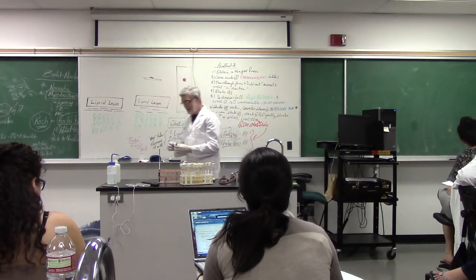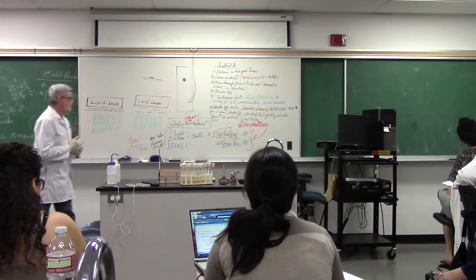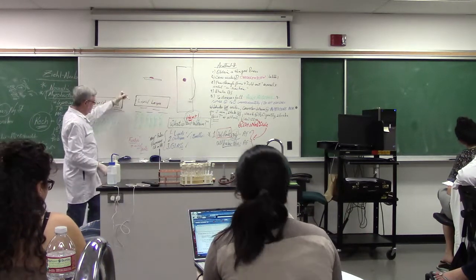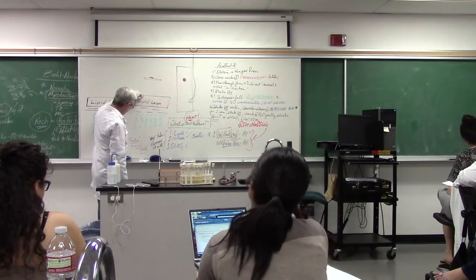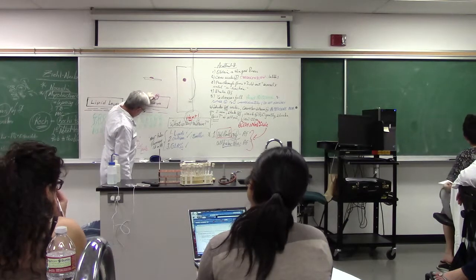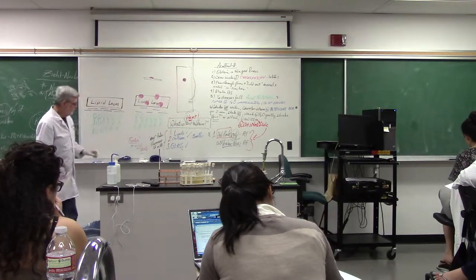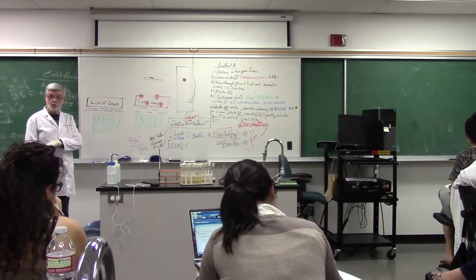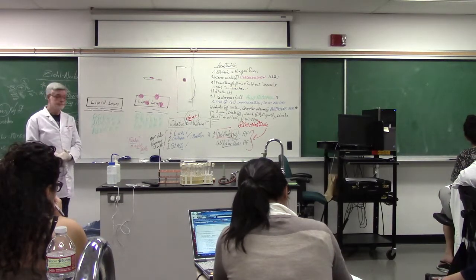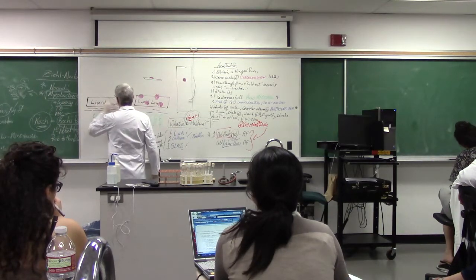So, that takes us to problem staining. And let's talk about problem staining. Remember, the carbol fuchsin gets trapped in this lipid layer here. And that's why that stains hot pink. But carbol fuchsin is again dissolved in both water and an alcohol, so some will reject it. So some of them will just stain the last color you put on, which is baby blue.